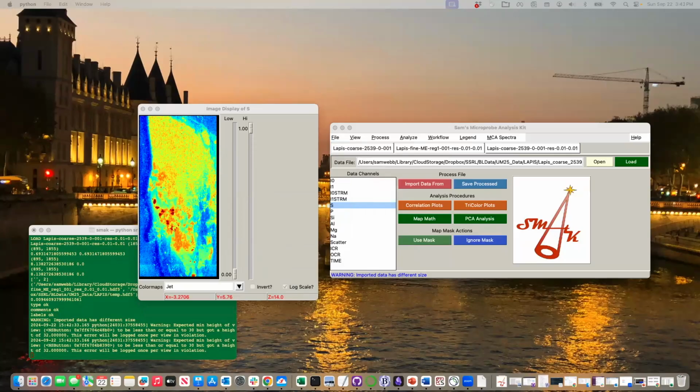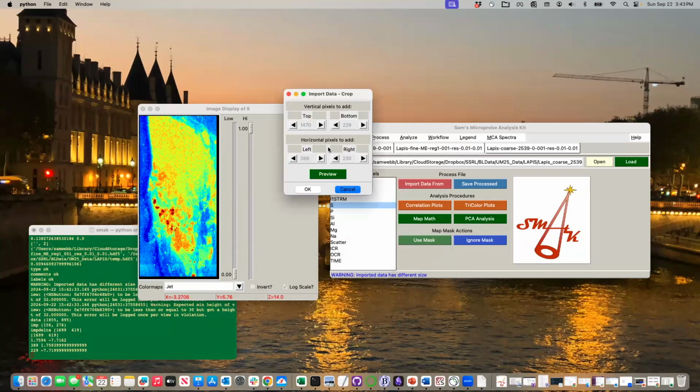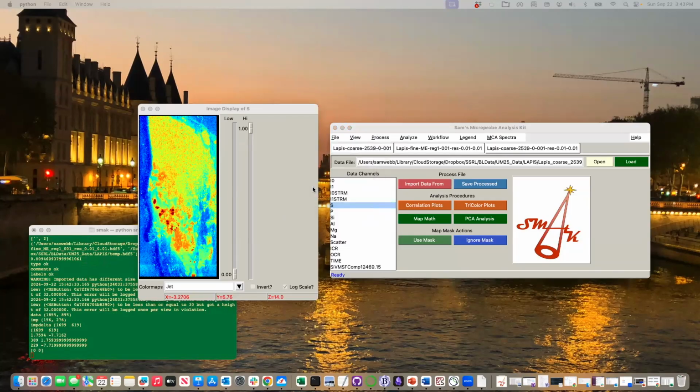Oh, no, I'm sorry. Now it's asking me down here. Whoop, bring it up. Do you want to name it? Sure. Let's call it that. It's telling me that it's going to pad 1,400 pixels to the top, 200 at the bottom. It's actually looking at the coordinate positions of each file and trying to tell you where you should put it. And so because this is the same beamline, those coordinates are the same coordinates, and we're in the same scale, same 10 micron scale, we should be like, yeah, I want to do that.